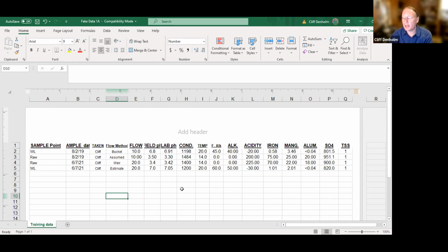So let's say this is your Excel file, and this is the way that you've been storing your data. There are certain things that are important to be able to upload this data. The first thing is that to a certain extent, it doesn't have to be an exact replicate of this, because there's a mapping step that you go through. What is important is that your parameters go across these columns.